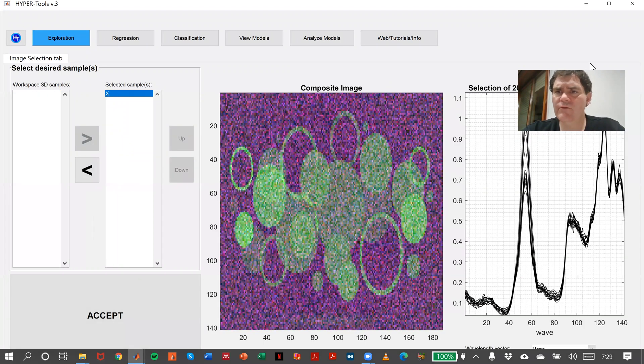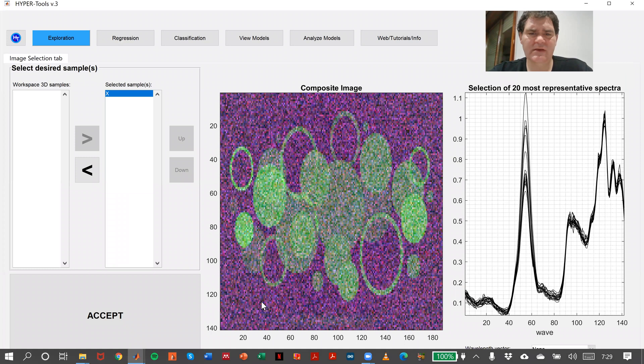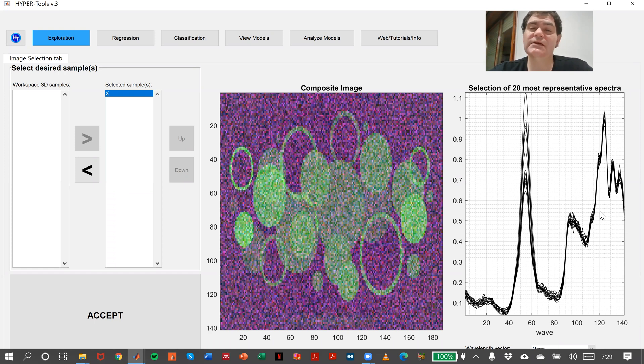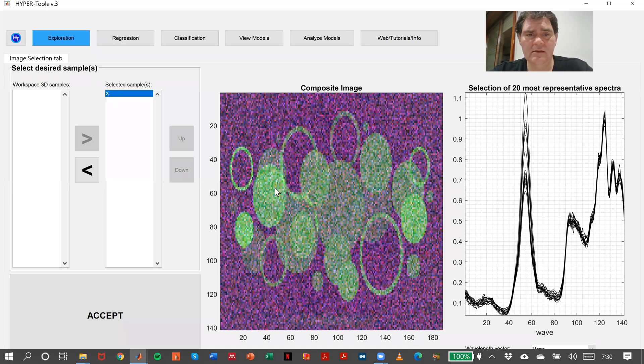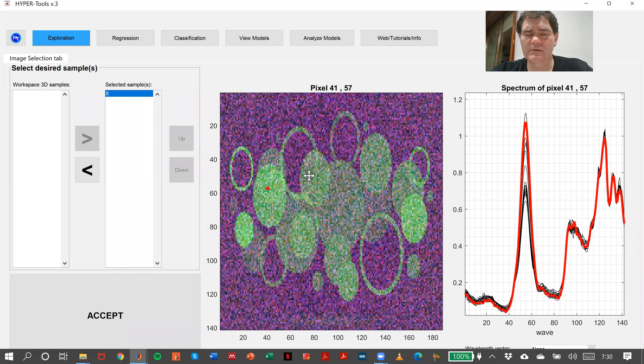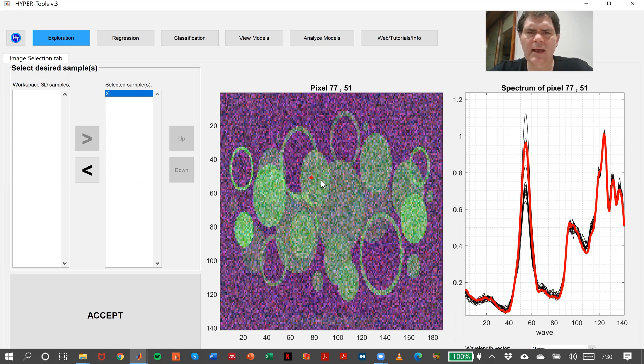We have this hyperspectral image with different circles, and every circle contains the concentration of one analyte. These are the spectra. If we just take this pixel, we can see this is the spectrum here, and also here is basically the same spectrum with a little bit different noise.